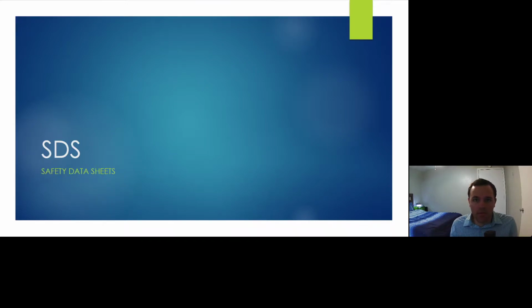All right, so for lesson 2, for the in-person students, this will be the second half of day 1, and for online students, this should be day 2. We're going to be talking about safety and lab safety and safety data sheets and everything related to that.